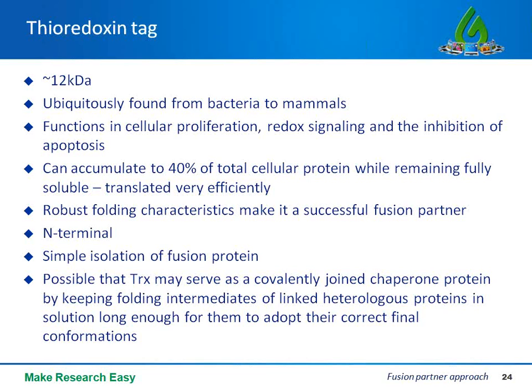Now various studies have indicated that thioredoxin is more effective when you place it at the N-terminal end. And one of the advantages with thioredoxin is that it accumulates at cytoplasmic membrane adhesion sites, which allows for a simple osmotic shock or freeze-thaw treatment in order to release the protein.